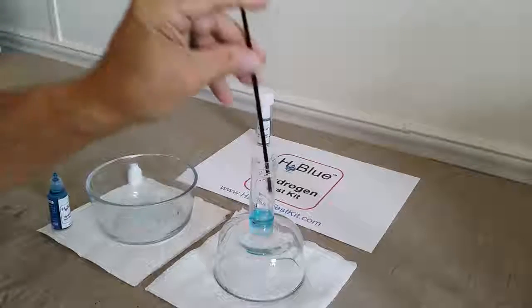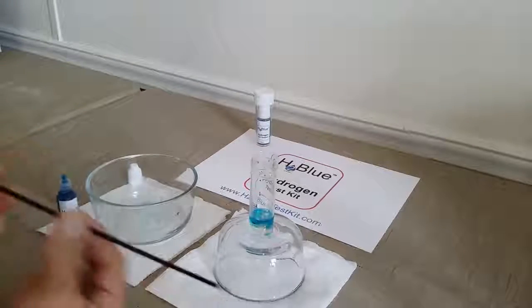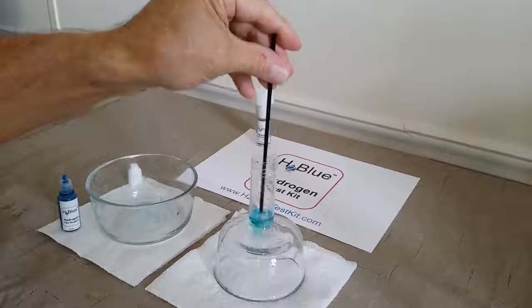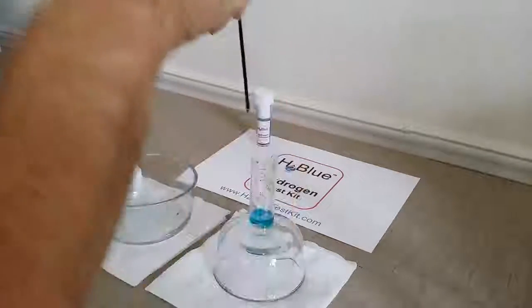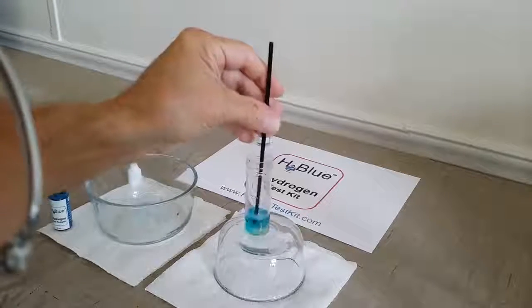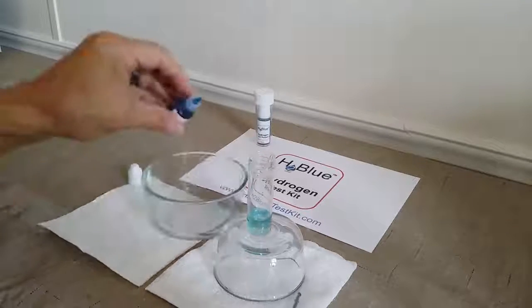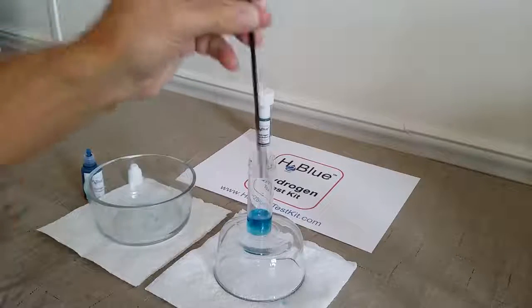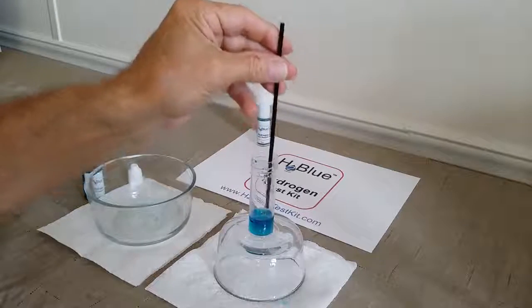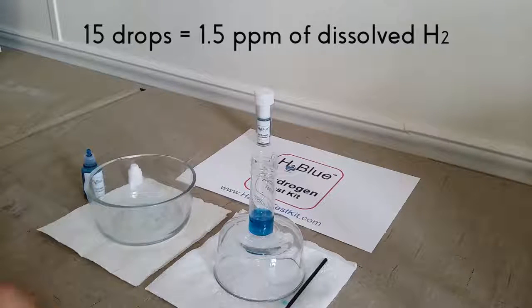And at 12 drops, you can see it still turns clear. Let's go 13. Still turning clear. 14. But it's getting close. It's slowing down. I'm going to add one more drop. And as you can see, that 15th drop turns blue and stays blue, so I know I've reached the titration endpoint. So that's all there is to it, very simple.